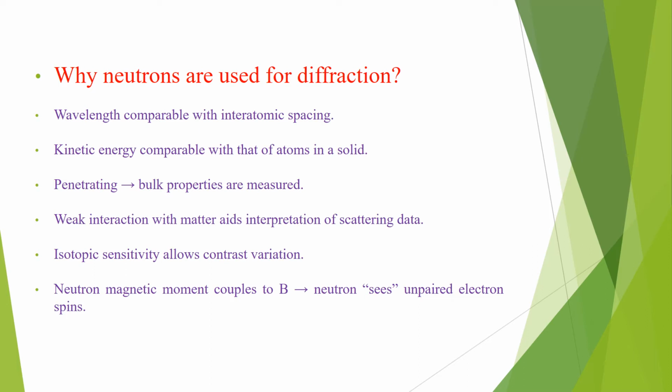It also has penetrating power. By using its penetrating power, bulk properties of the solid or of the sample are measured by neutron diffraction.